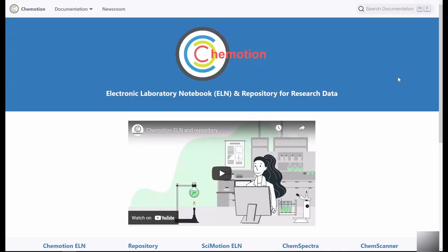Hi, and welcome back to this introductory series on Chemotion. In this video, we will briefly present the user interface of the Chemotion electronic laboratory journal, Chemotion ELN. The abbreviation ELN stands for electronic laboratory notebook.